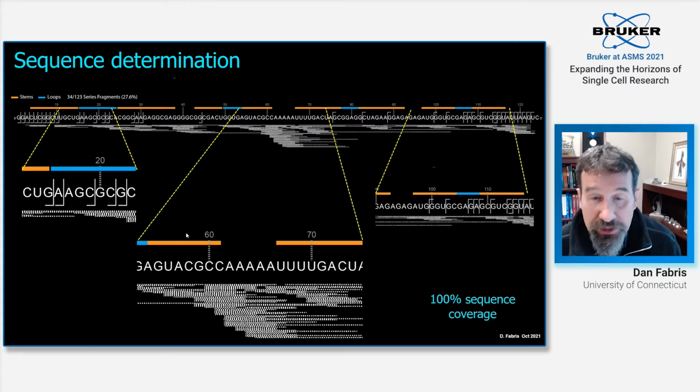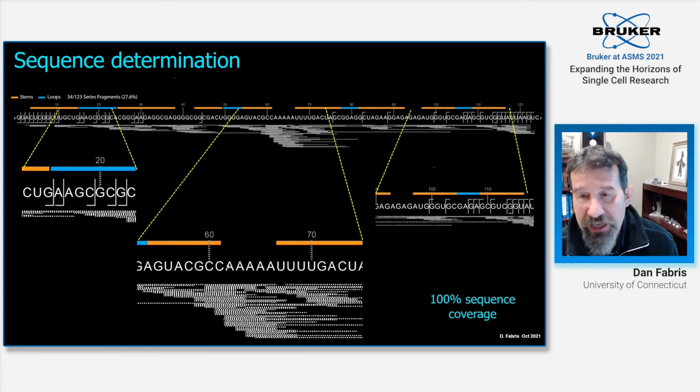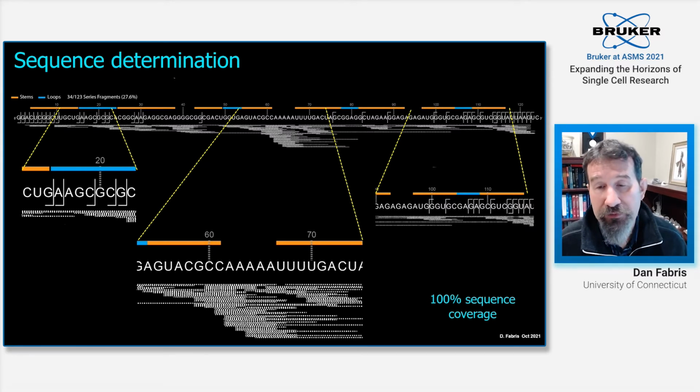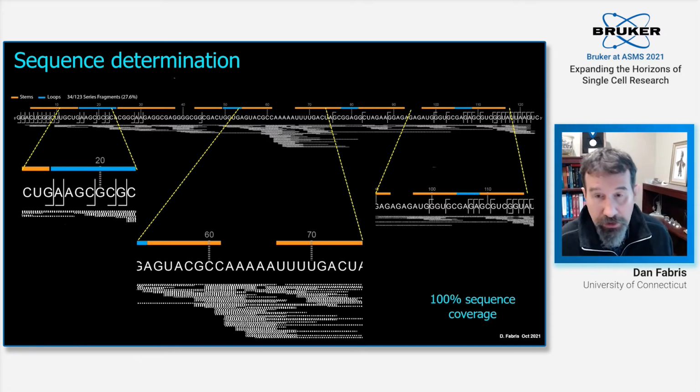If we zoom in on some regions here, we also notice that there are many of these internal fragments that cover the same region of the precursor ion. The situation here is very similar to what we can see in next generation sequencing data, where there are multiple reads that cover the same region of the analyte. And this is actually used to increase the confidence in the interpretation of this type of sequencing data. So we believe that the internal fragments can do for tandem mass spectrometry what this depth of reads can do for next generation sequencing data.